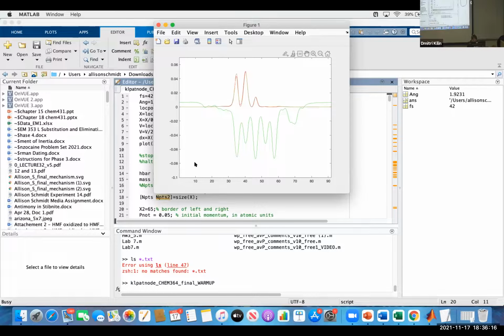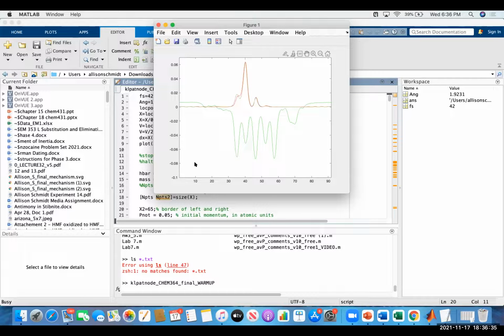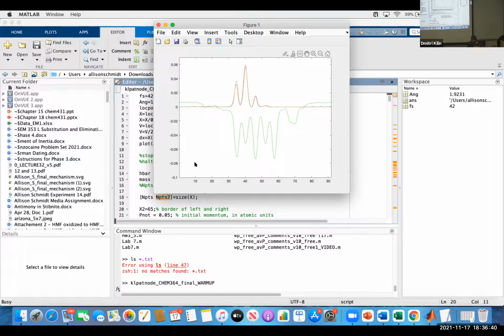So there are 3 segments in your data. The central segment from approximately 35 to 60 corresponds to the semiconducting layer of halide perovskite, which is very popular in scientific research right now. The object at approximately 70, you can point to it with the mouse so that I see you've followed what we're discussing.